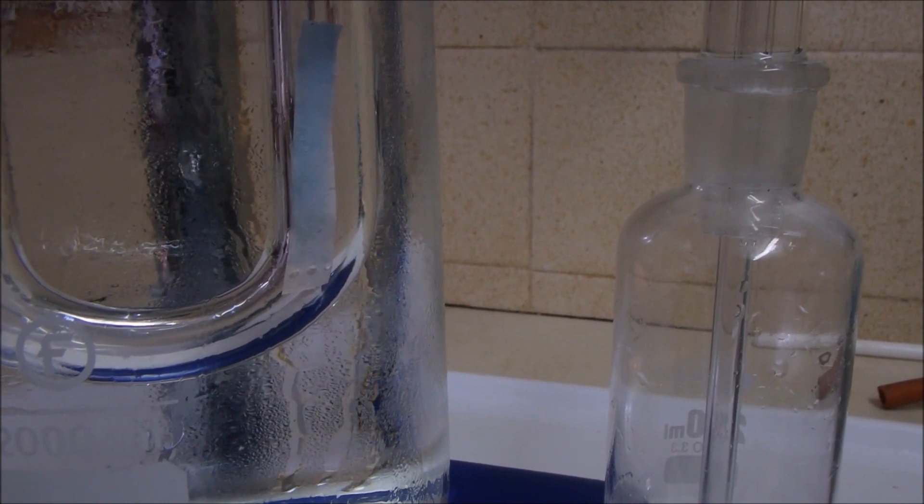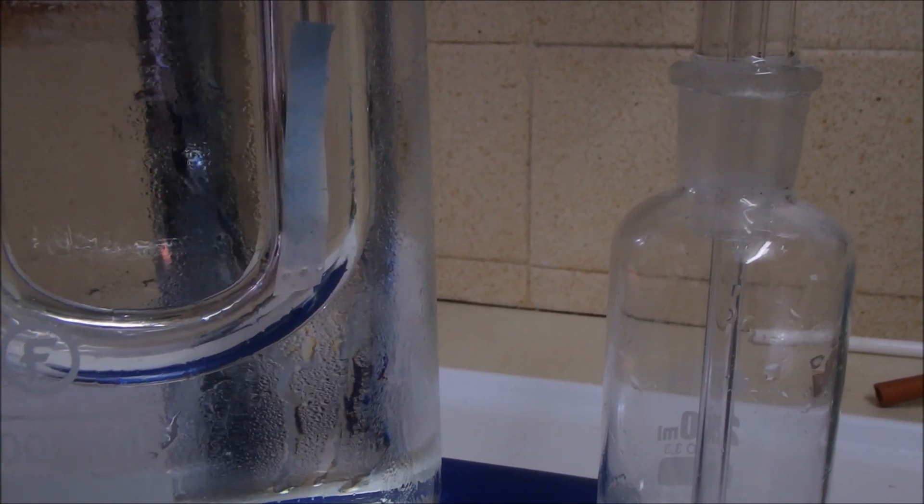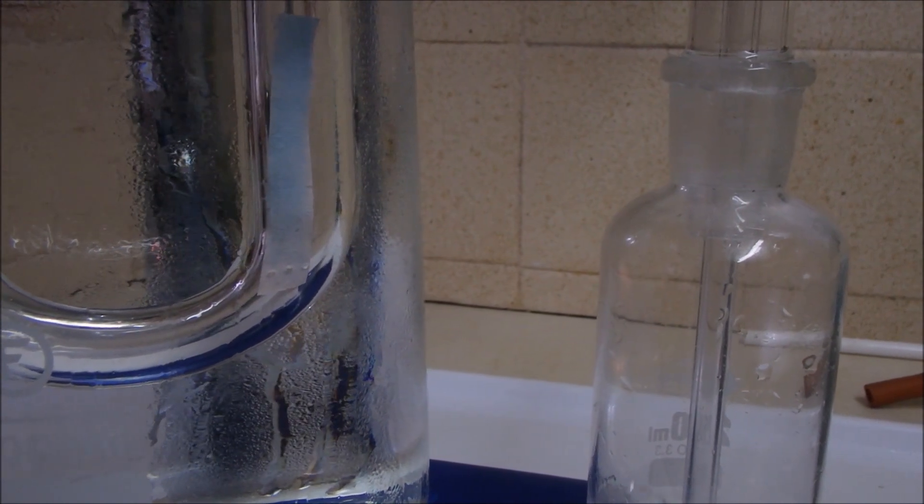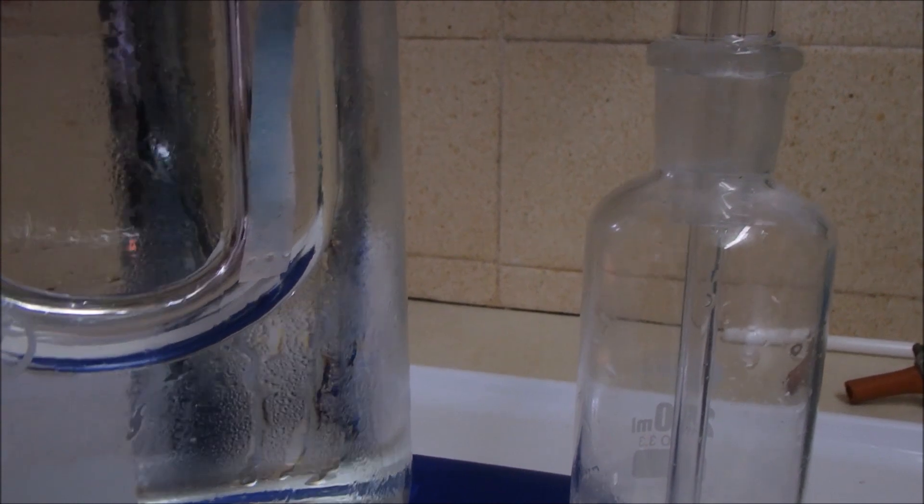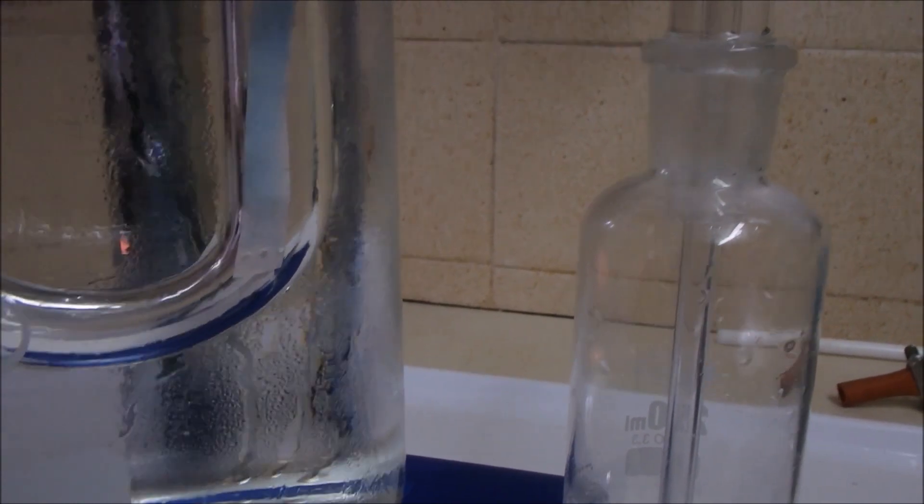Carbon dioxide. And? Oxygen. No, not oxygen. What are we testing for? What's the blue cobalt chloride paper testing for? Water. Water. So we've got water and carbon dioxide.